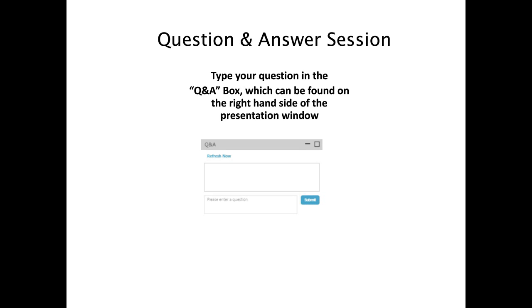Okay, so here we go, Stephanie. How does sample loading capacity compare between superficially porous particles and fully porous particle columns? Okay, that's a great question. We get that question a lot, actually. So it really depends on what analyte you're looking at. So in general, for neutral compounds, I'd say you get about 80% the sample loading on SPP columns versus FPP columns.